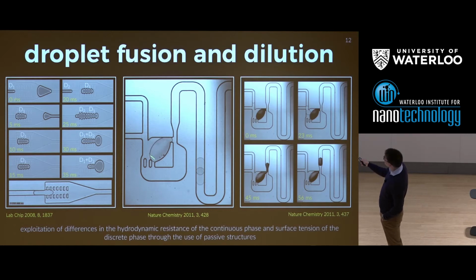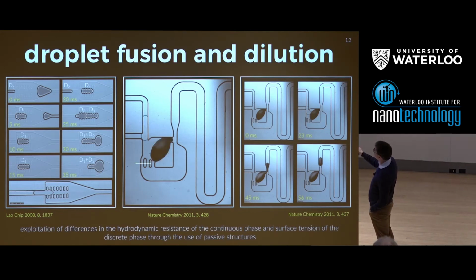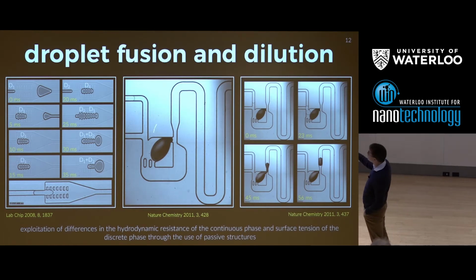And if you've been looking, you'll hopefully have seen the optical density of the mother droplet and the daughter droplets getting lighter and lighter as we progressively dilute. And the reason this works, again, is because this soft valve here provides a mechanism to initiate merging. And because we're using a continuous flow of our oil phase, we can remix the contents in the center.